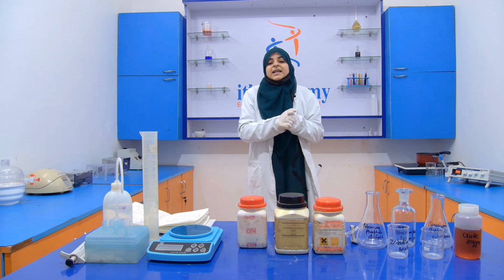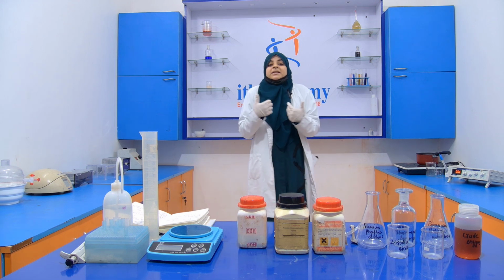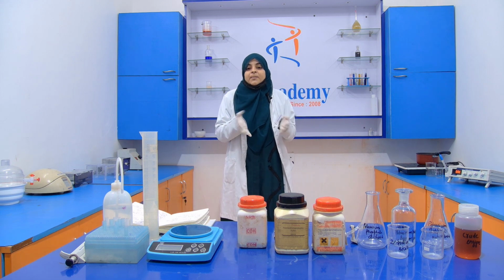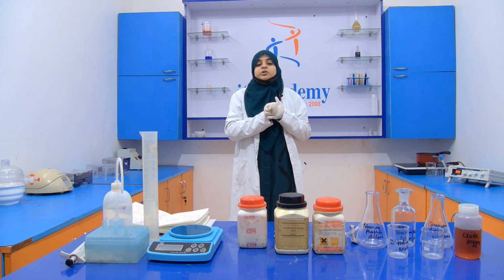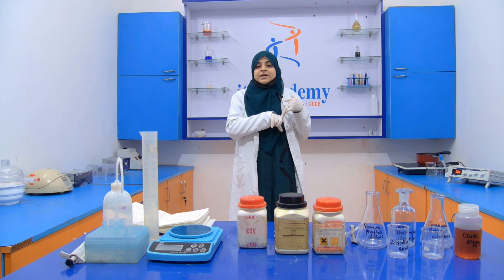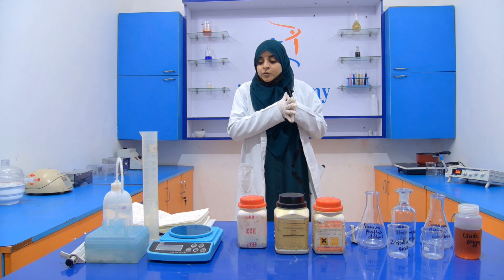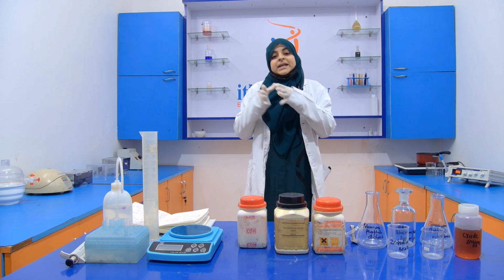Now, before starting the experiment, we have to know why we perform this purification of the protein. What is the aim of the purification of the protein, or what is the requirement of the purification of the protein? So, here are the requirements. The first one is that we have to study the structure and the function of the protein that we desire. And the second is that we have to study the protein regulation and the protein interaction.